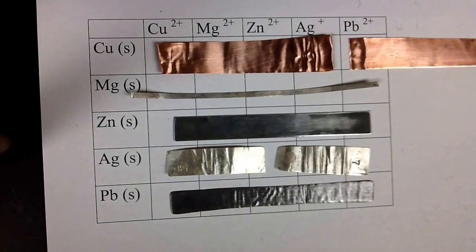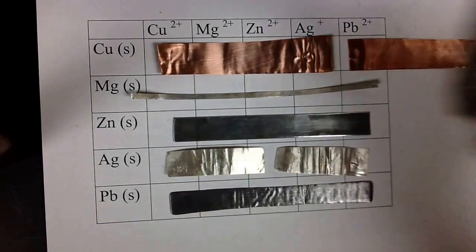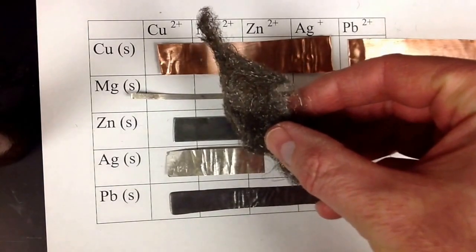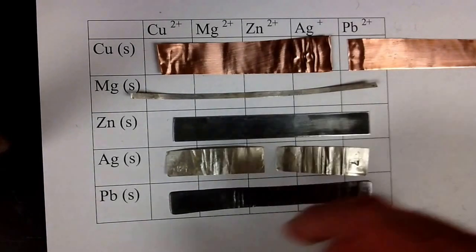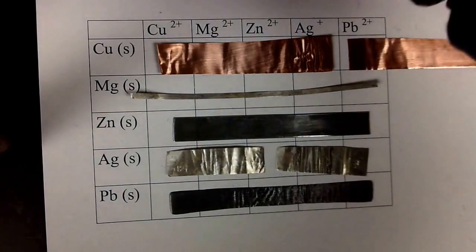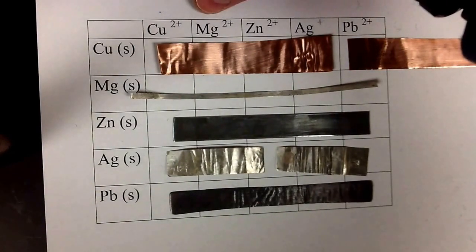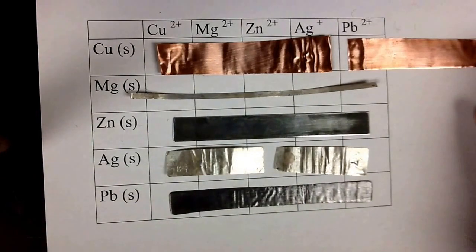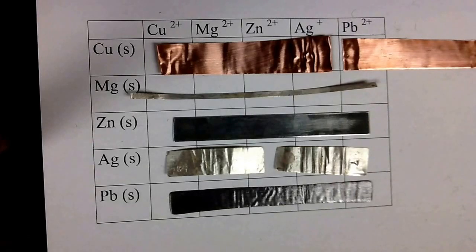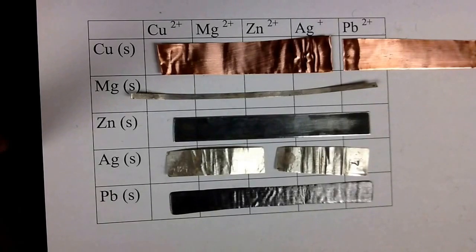And they're nice and shiny because I took some steel wool and I shined them up, got rid of any residue, any corrosion on there, and I'm going to put these solutions. These are all solutions of copper ions, magnesium ions, zinc, silver, and lead ions. And these are all actually solutions of the nitrates, so copper nitrate, magnesium nitrate, and so on.